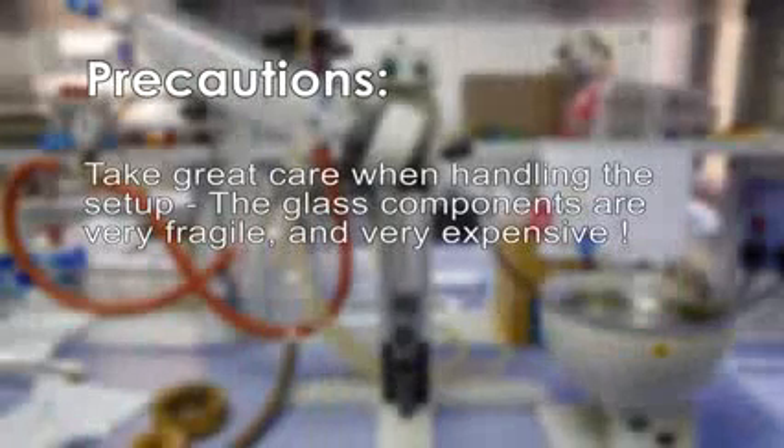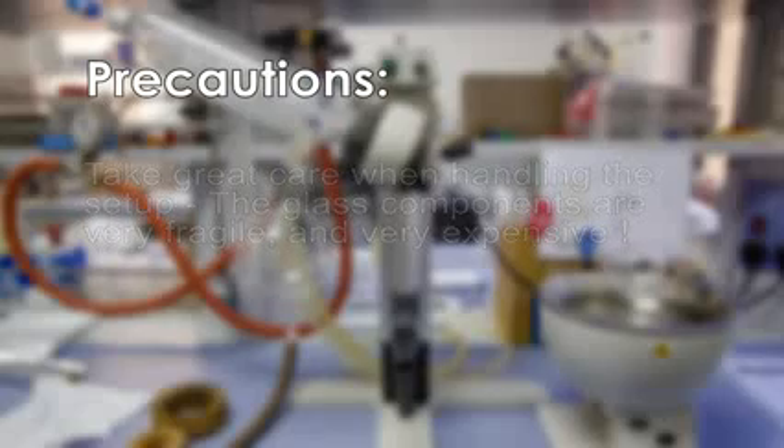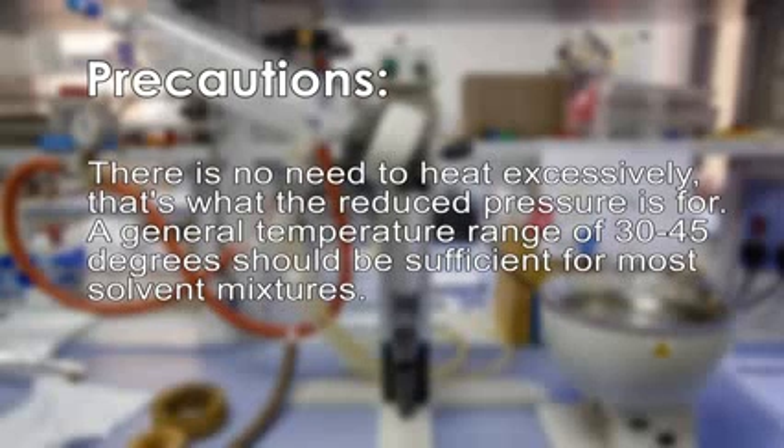Take great care when handling the setup — the glass components are fragile and very expensive. There is no need to heat excessively; that is what reduced pressure is for. A general temperature range of 30 to 45 degrees Celsius should be sufficient for most solvent mixtures.